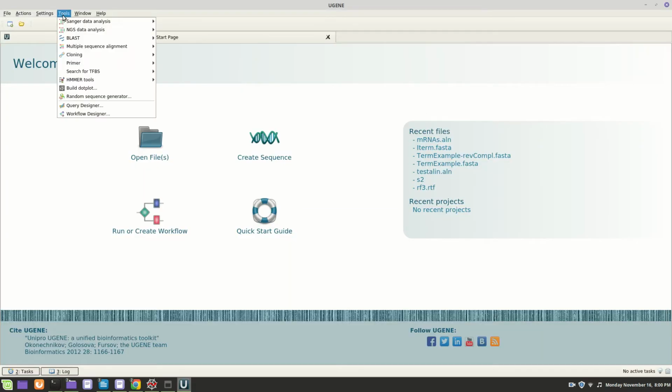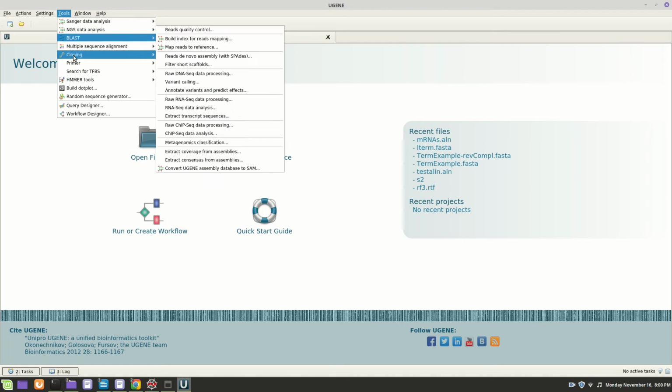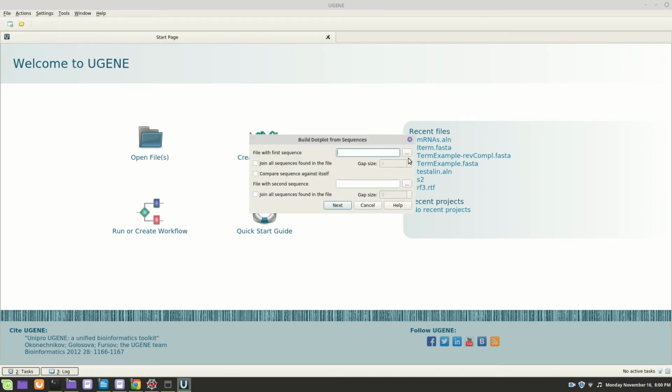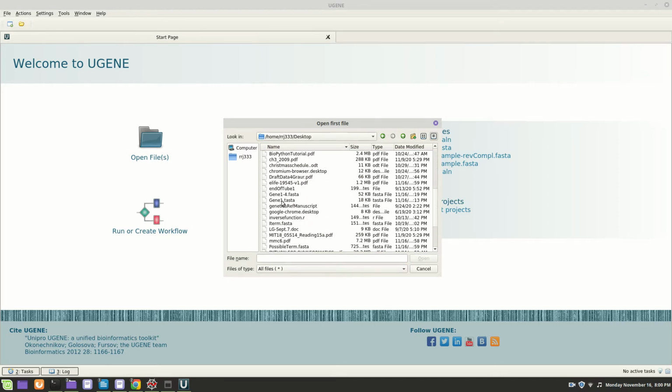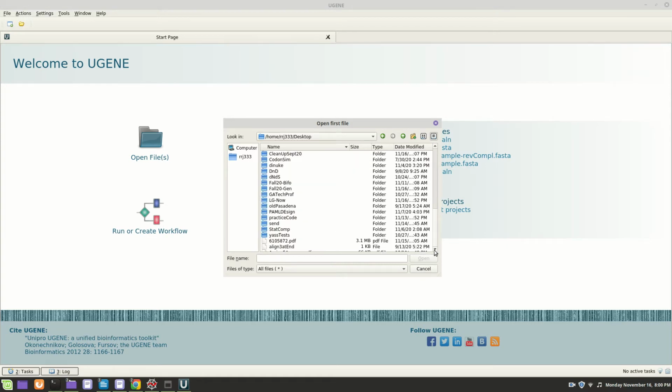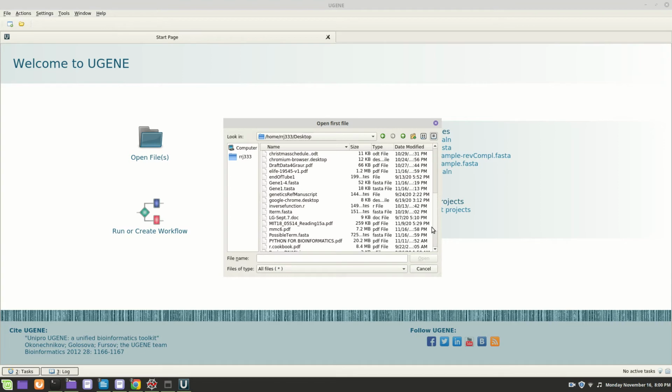And what we want to do is go over here to the dot plot, and we're going to grab off the desktop, what did I call it? Termination. Potential termination or something.